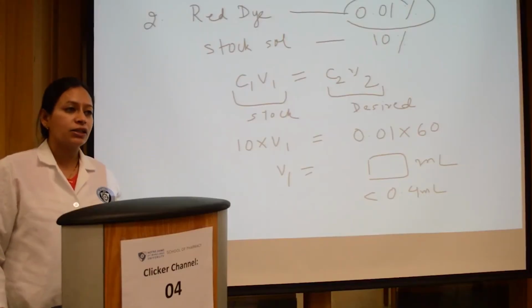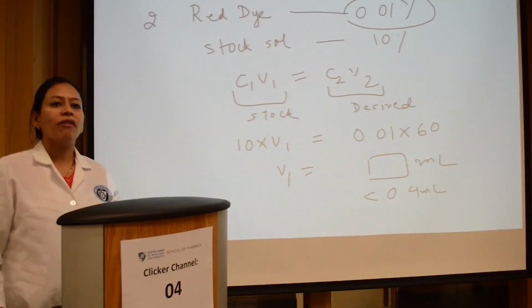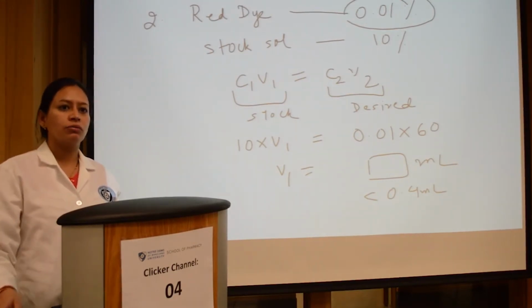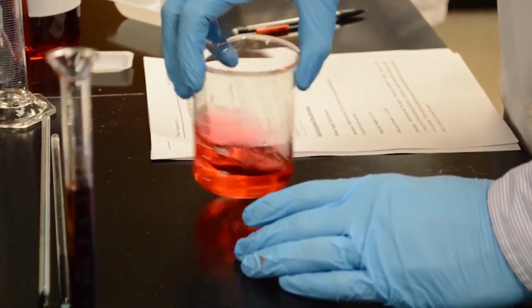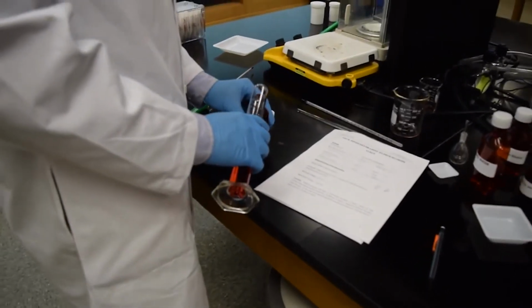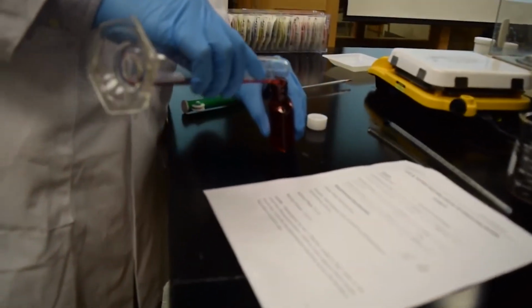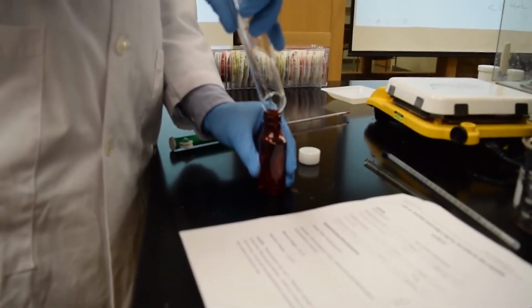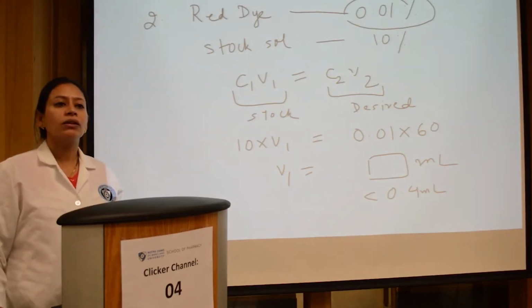So once the entire sugar component is dissolved in the water, you get your syrup. However, because it's a medicated syrup, it's not just a plain sugar syrup, you have to have your drug, which is your diphenhydramine hydrochloride, add the flavor, add the colorant in a separate beaker, and then mix the two things together. Okay, so that will give you the final diphenhydramine hydrochloride syrup. Alright, so once you formulate your syrup, let it cool down and then label the preparation appropriately and dispense. Any questions?